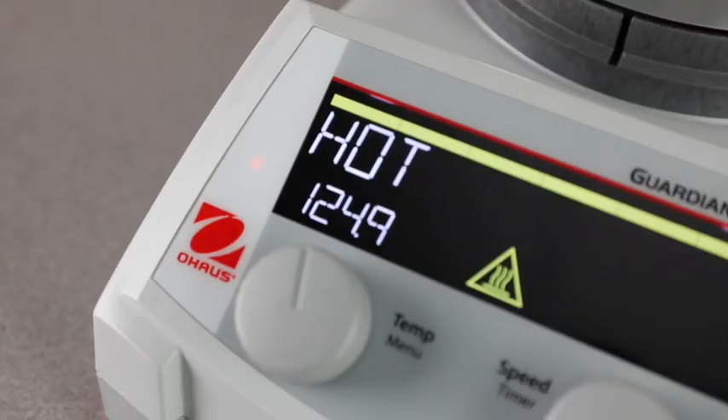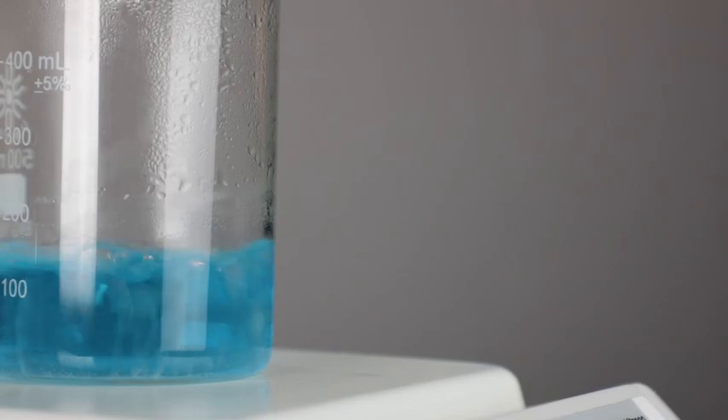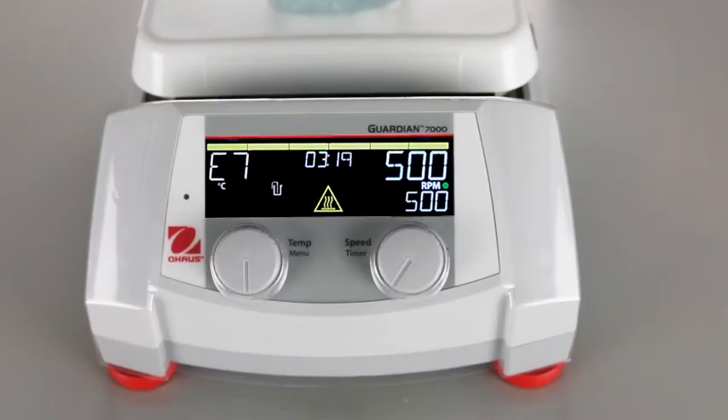Safety Heat, our industry-leading internal protection system, assures safety in heating applications with dual monitoring of system health, shutting off heating before an over-temperature condition occurs and alerting users on the front control panel.